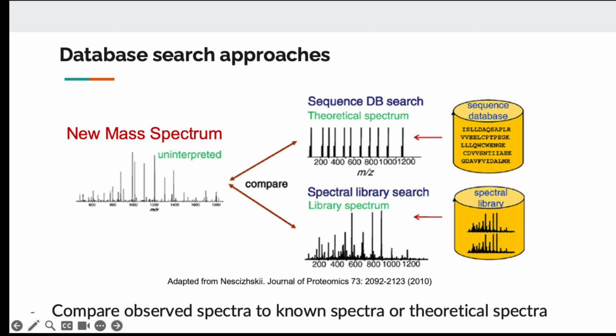So given the known sequence of amino acids, we can generate what the possible spectrum would be, what the mass-over-charge should be. And then we can compare this expectation to the data. And if the mass-over-charge values all line up, then that might be our answer.